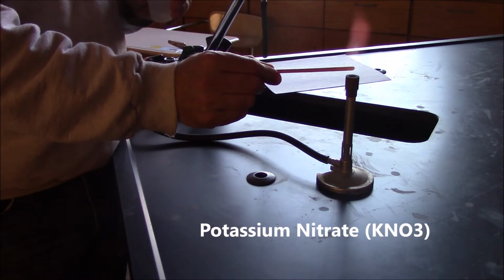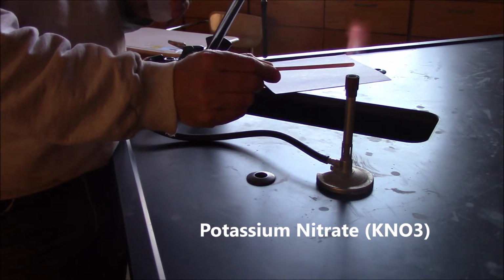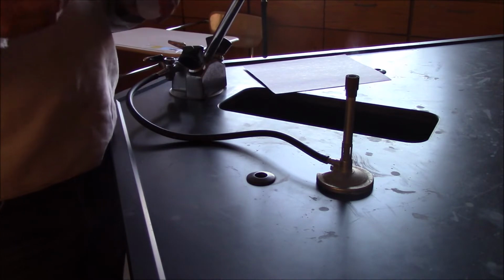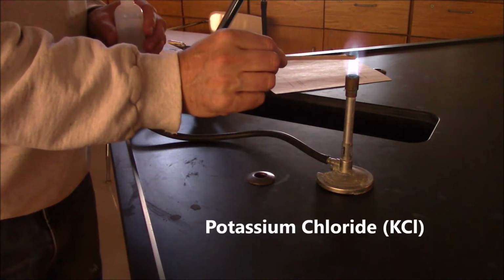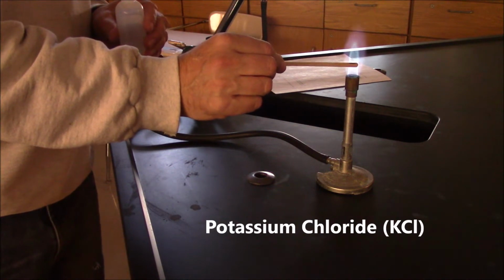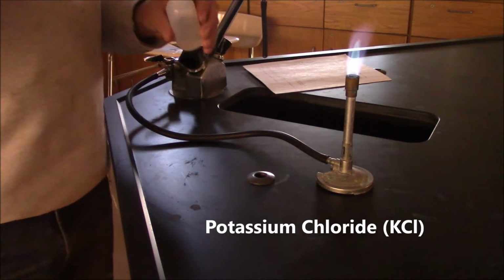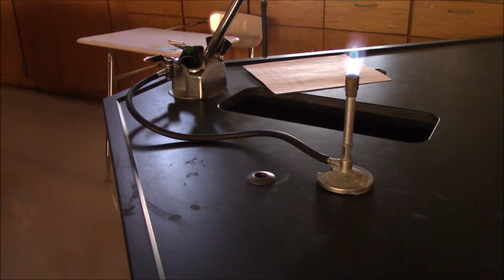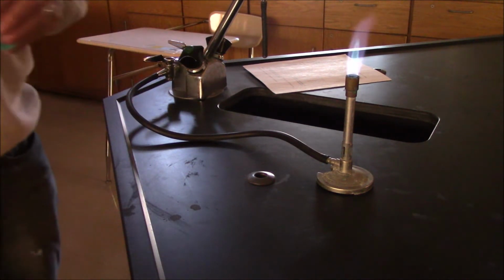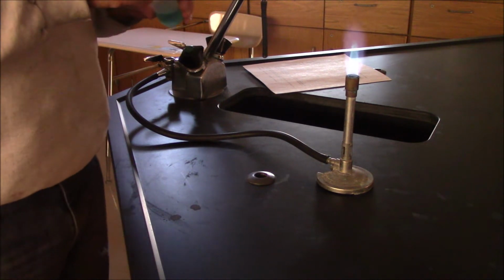Next up, we have potassium nitrate. Here we go. Now we're going to do potassium chloride. Next up, copper 2 chloride.